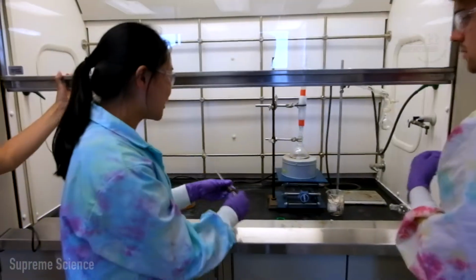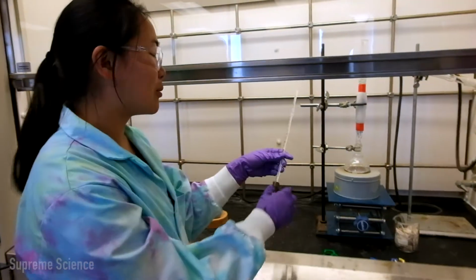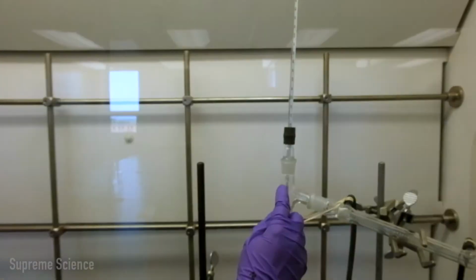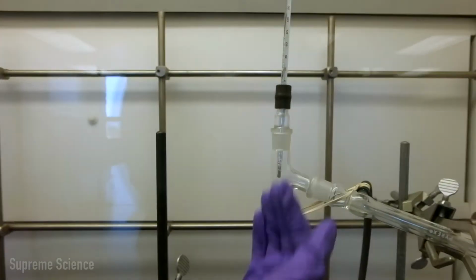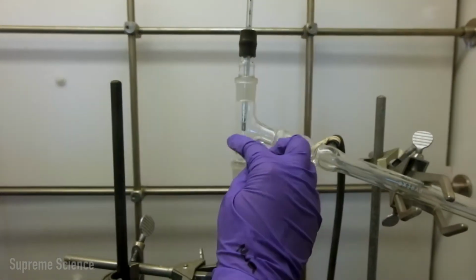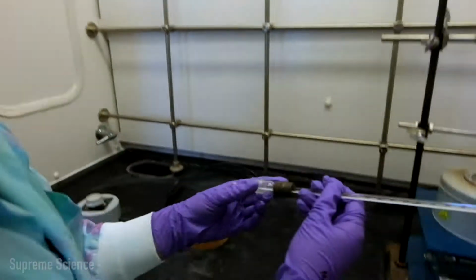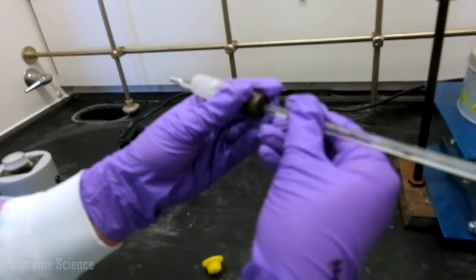Okay, so the last thing that you want to do is add your thermometer, which is in your thermometer adapter. What's important is you want your thermometer to be right in the middle between the still head and the condenser. So you will take this one out and adjust it like this, holding it tightly and close.